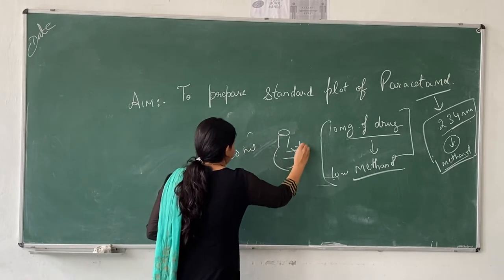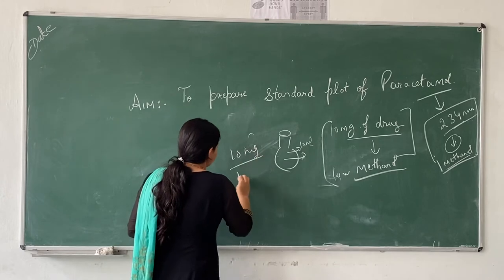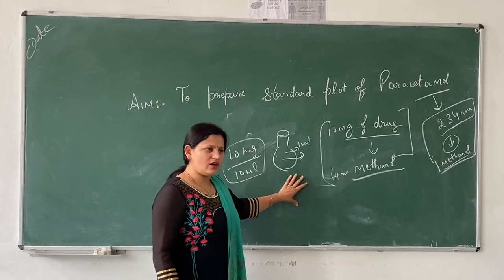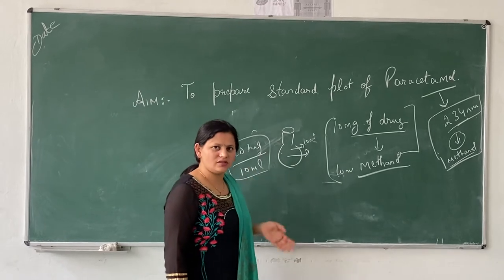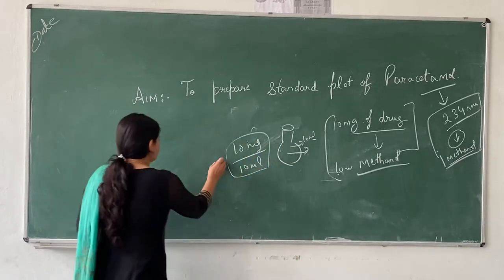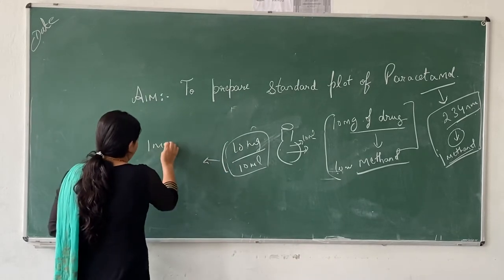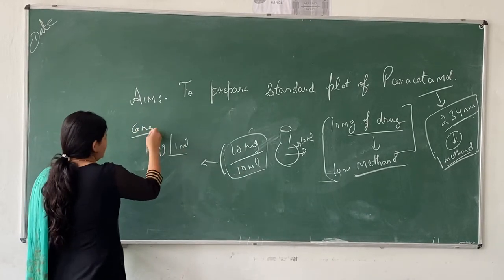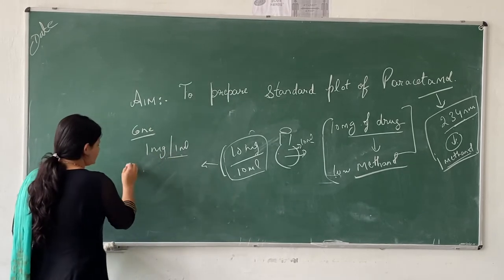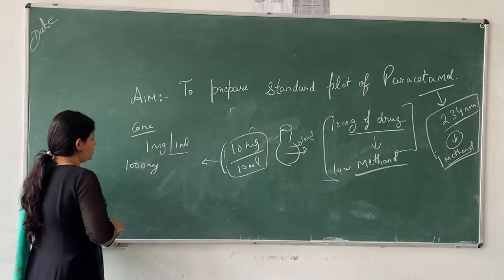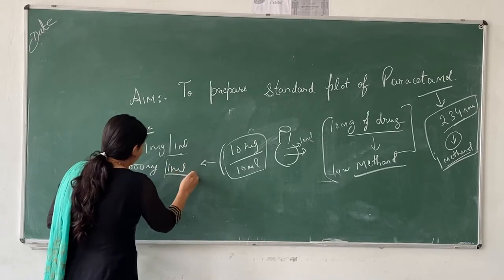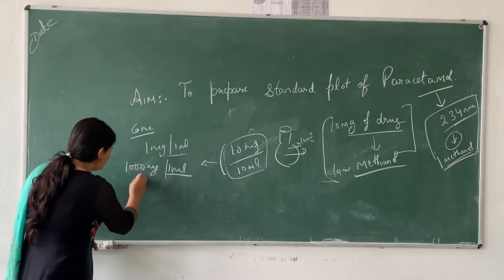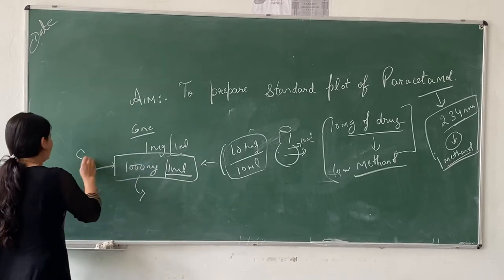This volumetric flask will now be made up to 10 mL. So 10 mg has been completely dissolved in 10 mL. If it is not completely dissolved, we need to sonicate this solution — we always require that the drug should be completely dissolved in the solvent. 10 mg per 10 mL means the concentration of this drug is 1 mg/mL, and 1 mg is equivalent to 1000 micrograms.